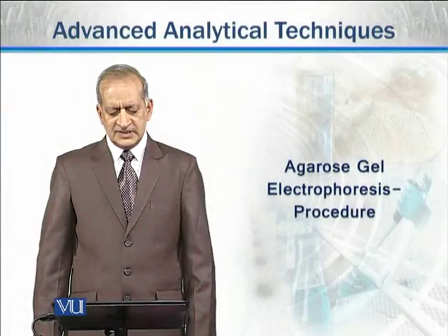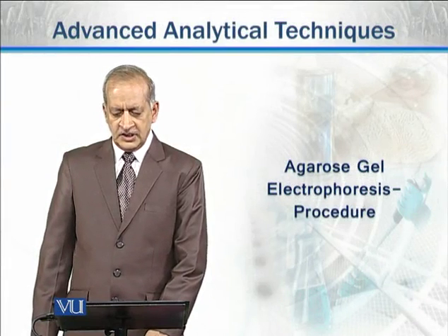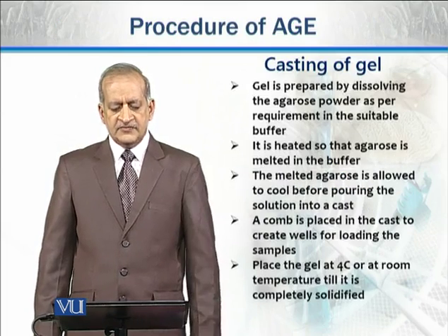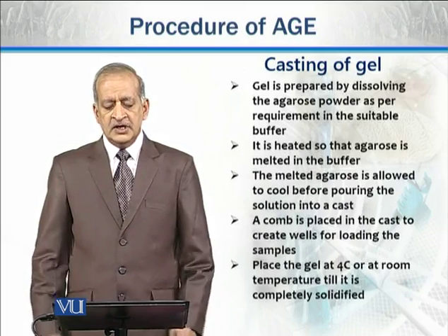So our next subtopic is procedure of agarose gel electrophoresis. We'll discuss how we are able to run gel electrophoresis. First of all, how gel is casted, how gel is prepared.